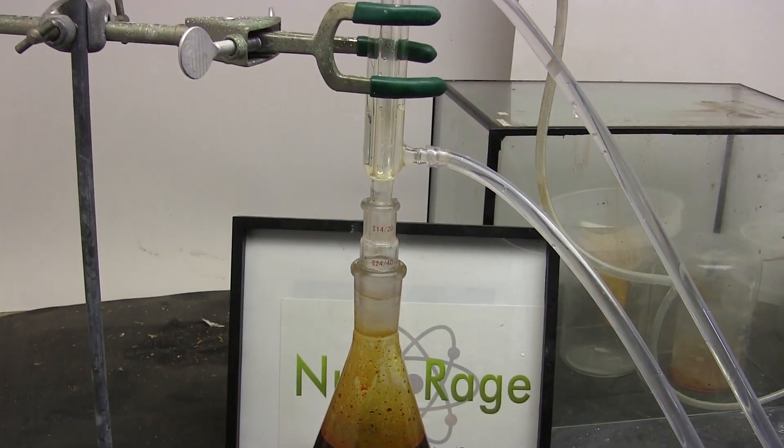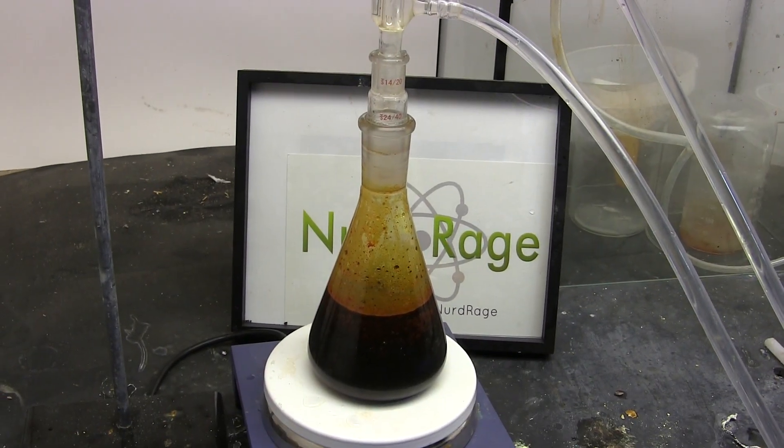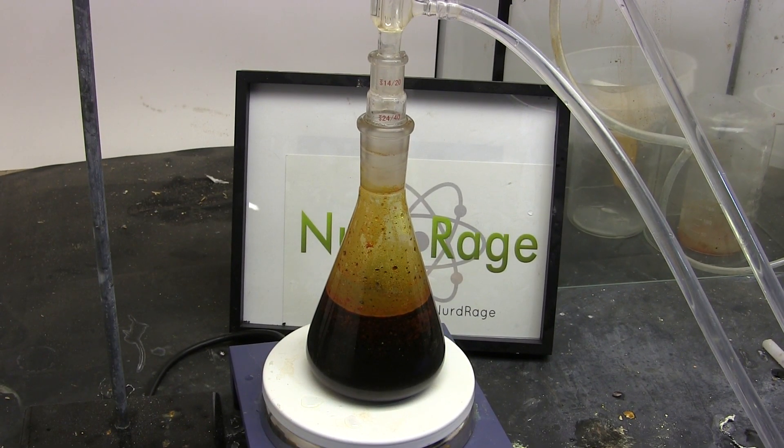Now we construct a reflux setup with a vertical condenser. The idea is that we don't want to lose any of our chemicals like bromine. Turn on the cooling, stirring and heating until the mixture just starts to boil.